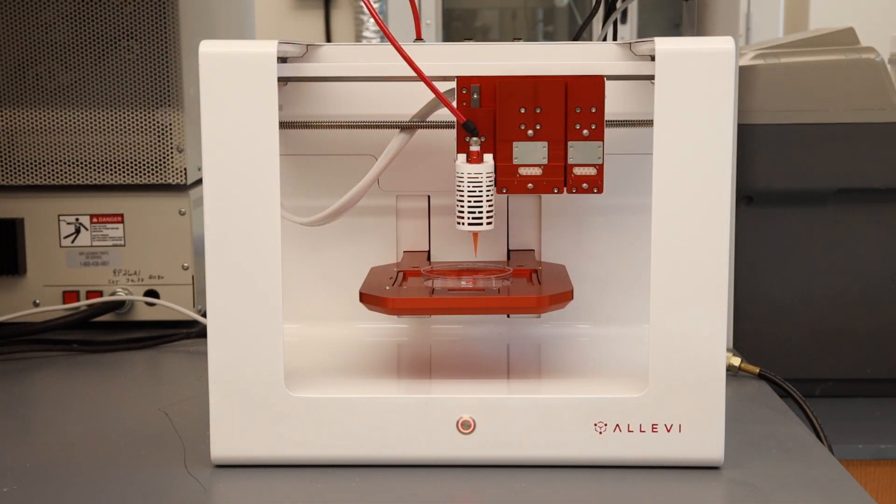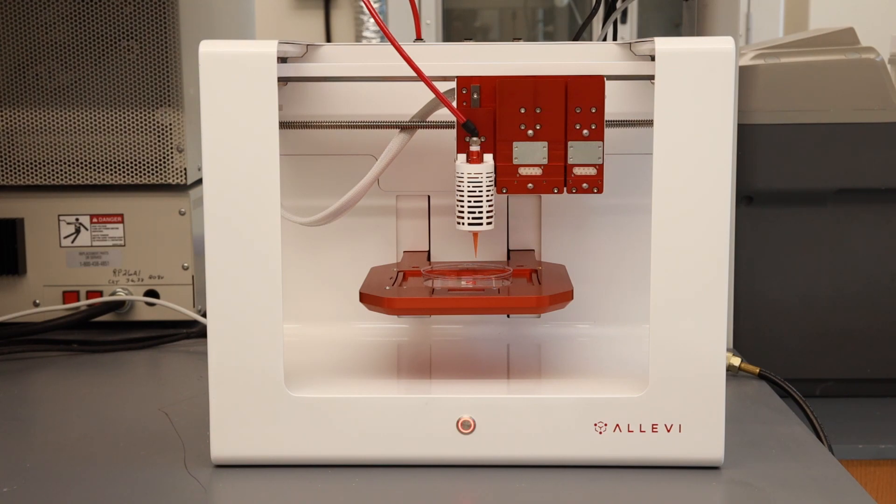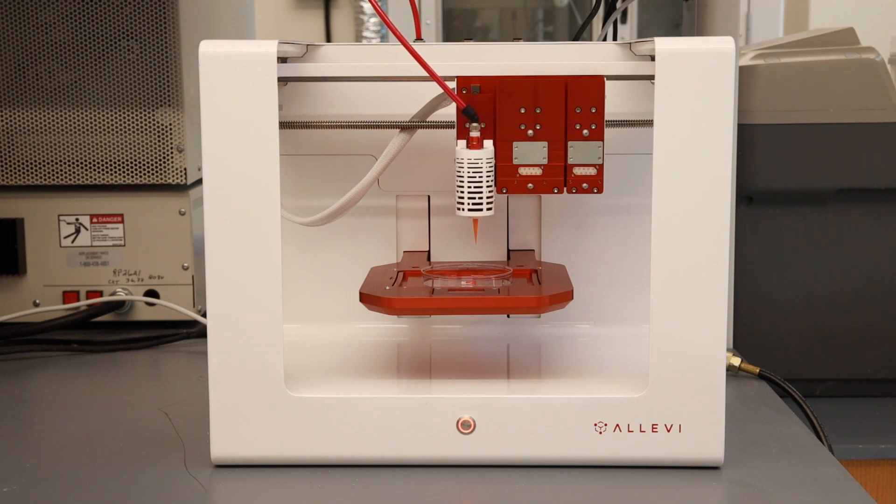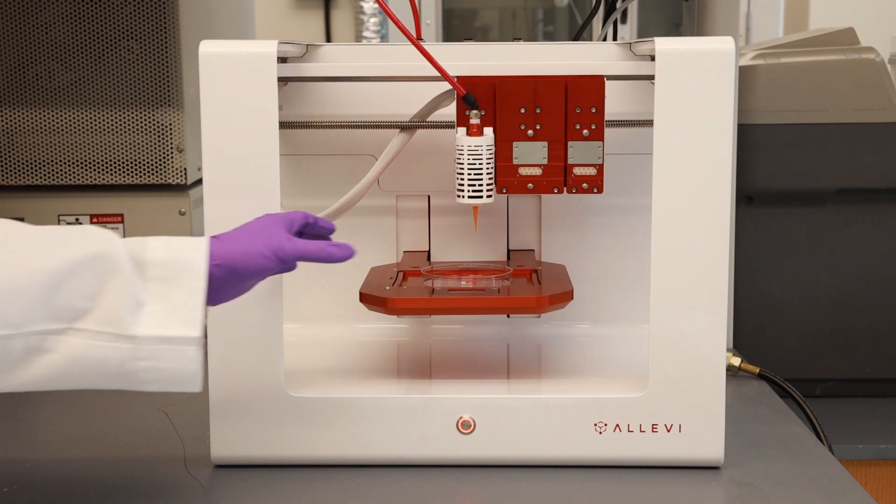After completing the printing process, go to the extruder section on the Alevi bioprint website and move the extruder to up position. Now remove the build plate.